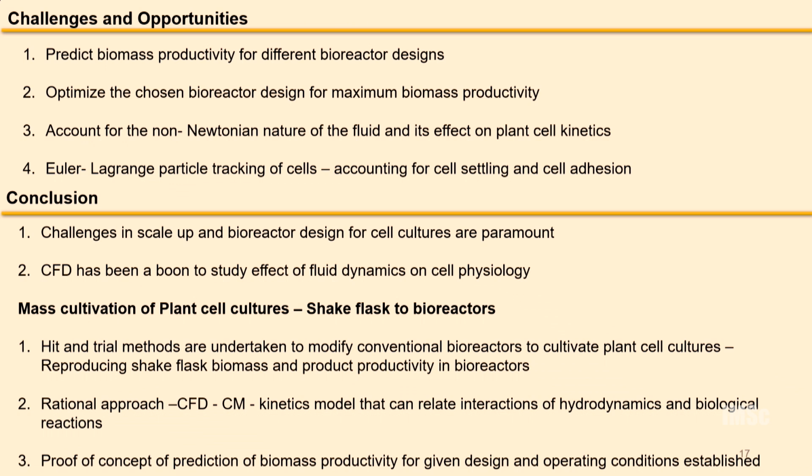And also we can account for the non-Newtonian nature of the fluid. Right now we are not looking into that. So we can see whether the non-Newtonian nature of the fluid is going to have an effect on the plant cell kinetics, and also we can look into Euler-Lagrange particle tracking. That is, we can take each cell as a single particle and see how it is moving around, and whether we can account for cell settling and cell adhesion also, so that we can look into these problems which are common in a plant cell culture bioreactor cultivation.